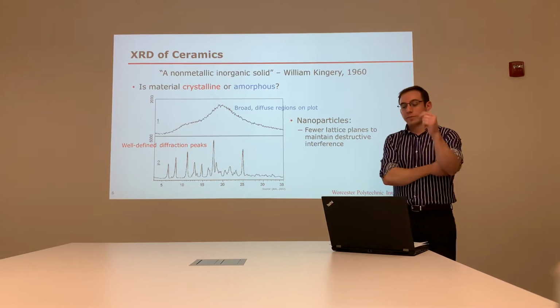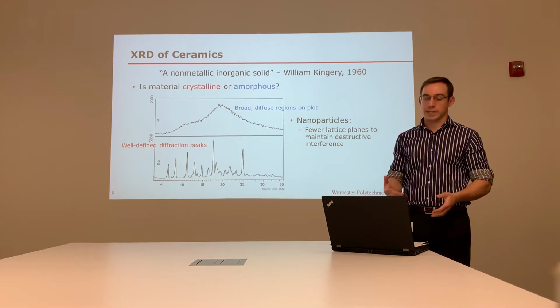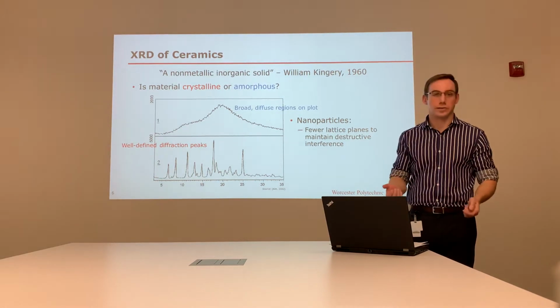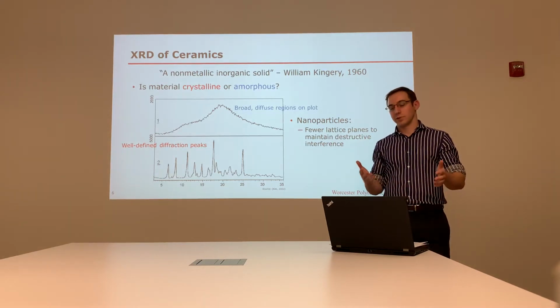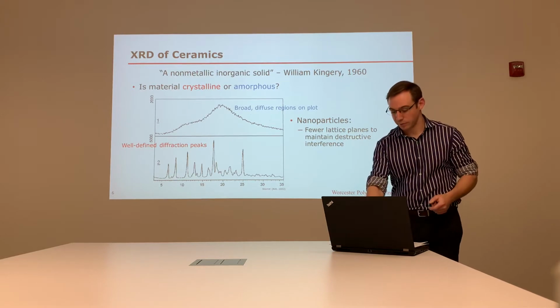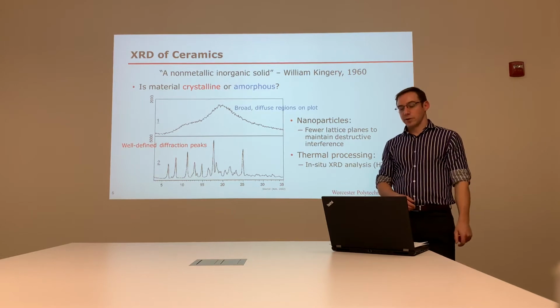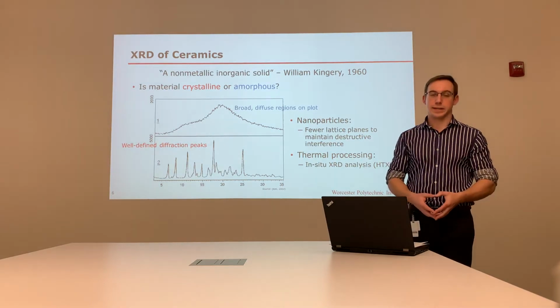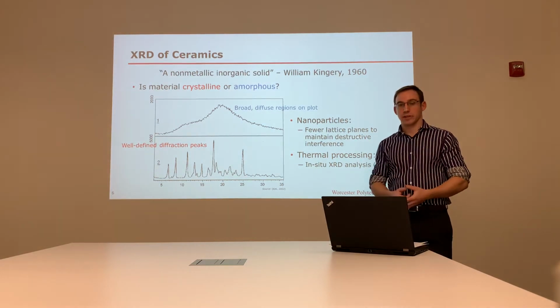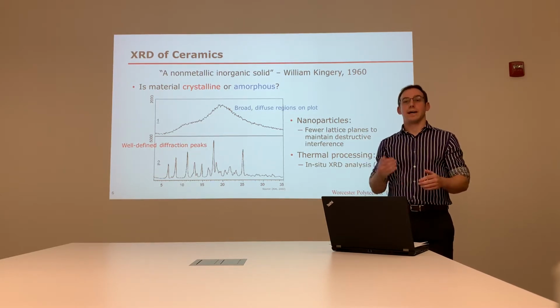So to perform X-ray diffraction on ceramics requires the use of nanoparticles. This is because there are fewer lattice planes in nanoparticles as opposed to microparticles, for example. These fewer lattice planes reduce the destructive interference from other amorphous phases that could exist in microparticles. So ceramics require thermal processing, and there's also in situ XRD analysis that can be done called high temperature X-ray diffraction to simulate exactly what is going on in the ceramic material as it is sintered and as it goes through those temperature changes.